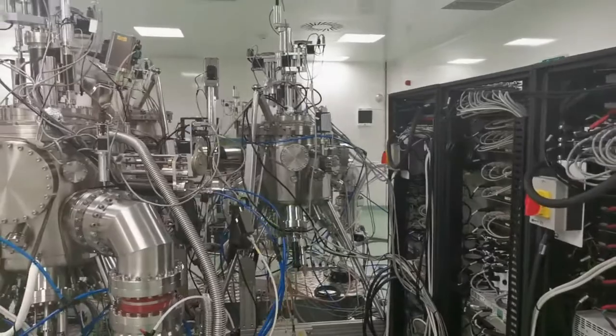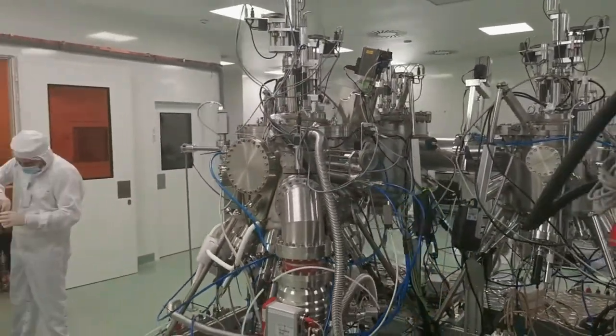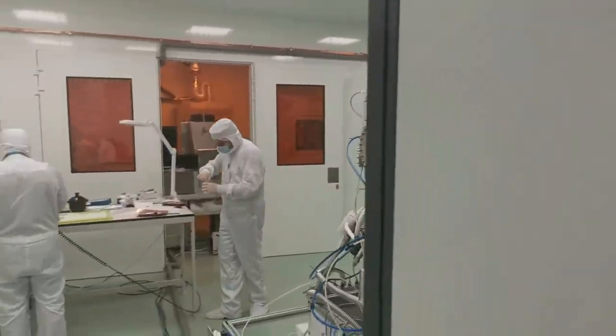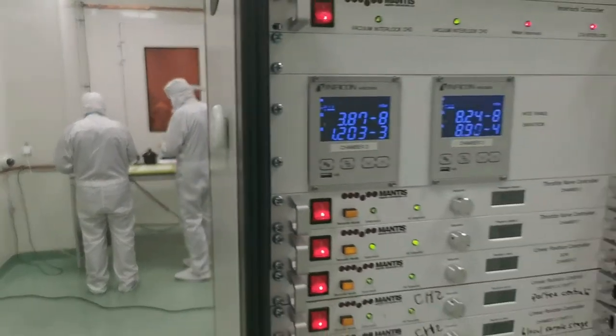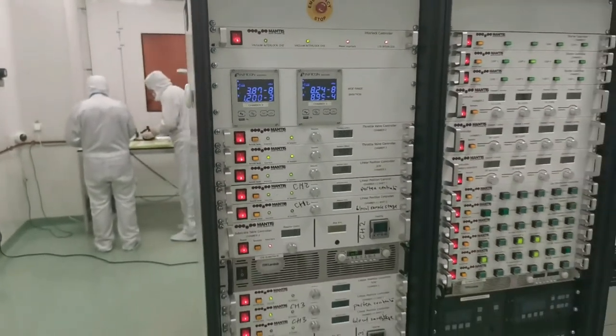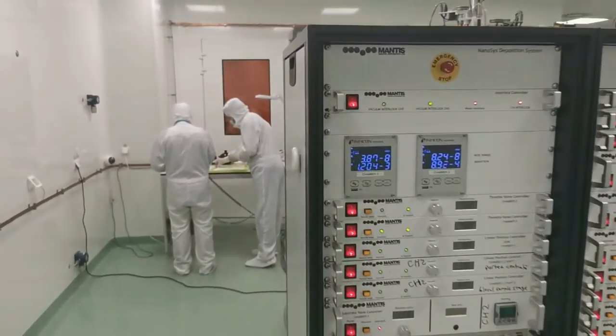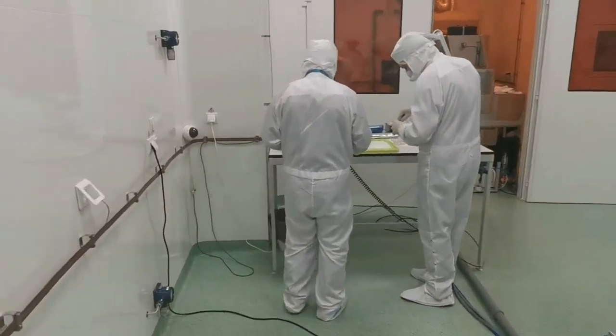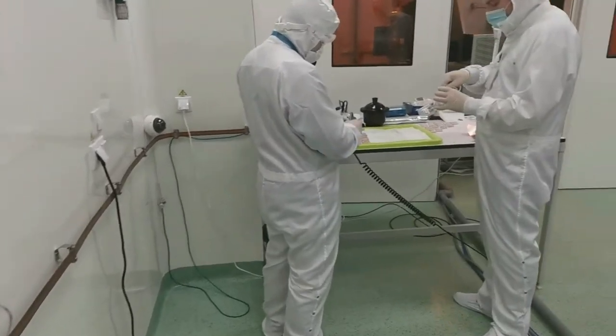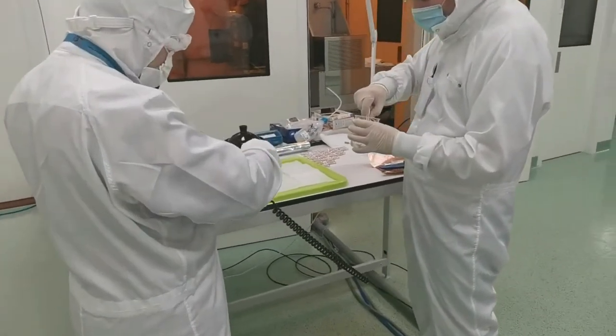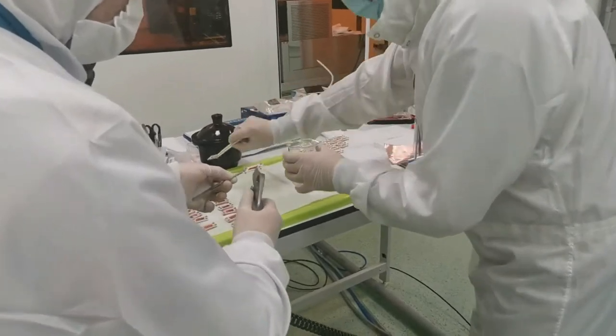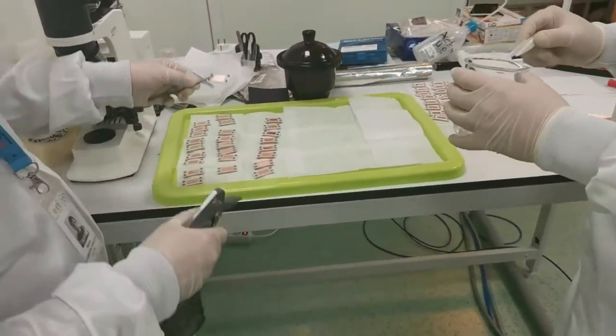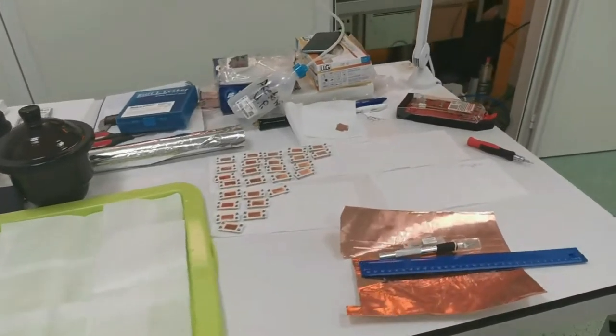The deposition system allows working with wafers up to 150 mm in diameter and deposition temperature up to 850 degrees Celsius for metals and nitrides or 1000 degrees Celsius for oxides. It has a base pressure of 5 times 10 to the minus 9 millibar, rotating sample stage, and controllable target to sample distance.